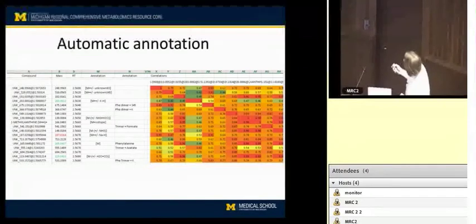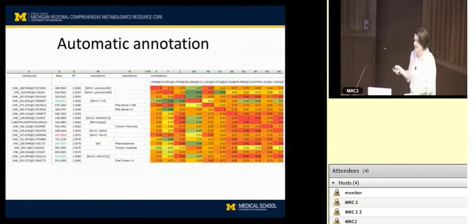So it can generate dimers, trimers, neutral loss peaks, and other adducts, like sodium and potassium formate. Surprisingly, one interesting thing that came out of this is that even if we don't know what an adduct is and we're working on figuring that out, if we see the same mass difference over many bins and many data sets, we know it has to be some kind of adduct.